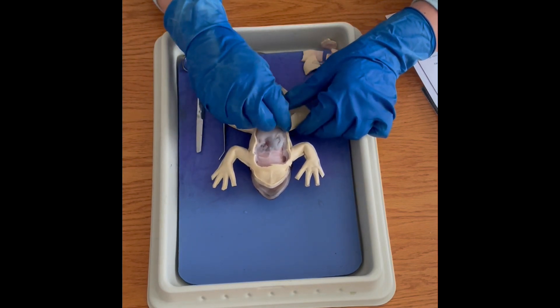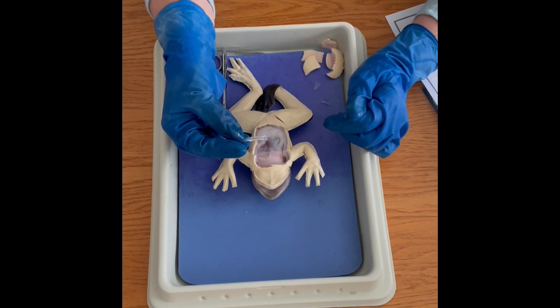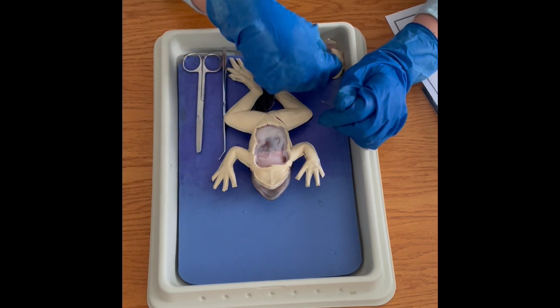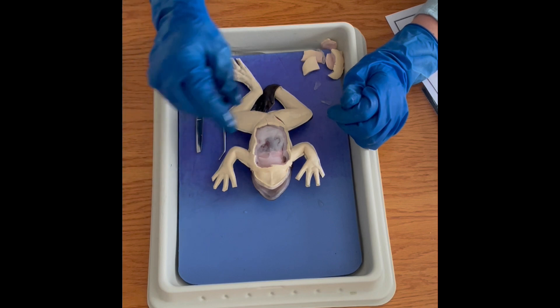As I was cutting through what would be ribs, that's made from plastic and it is fairly difficult to cut through — a little harder than a real frog specimen. You should definitely have students wearing safety PPE: gloves, aprons, and goggles, just so that if anything is sharp or fluids jump out at them they are still prepared. Even though this isn't prepared with formaldehyde, it does still have chemicals on it, and we're dealing with sharp objects, so just have your students be careful.